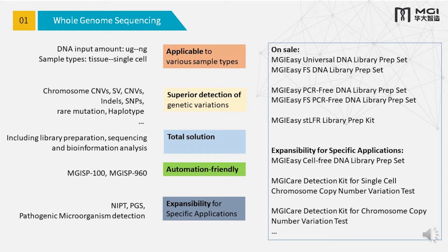If you look at all the product introductions, you see SNP accuracy and indel accuracy, but you don't see much about copy number variations, CNVs and SVs. And even for very complex cases, like rare disease or low frequency mutations in the genome, you don't see much information, and also nothing on haplotypes. So there are lots of markers or variants you can get from whole genome sequencing.